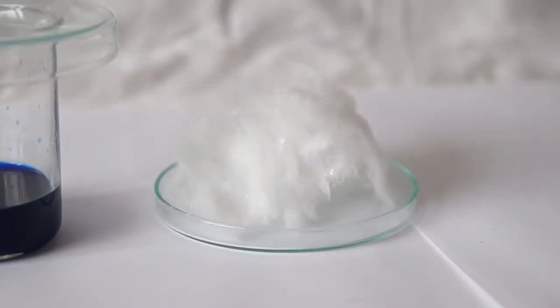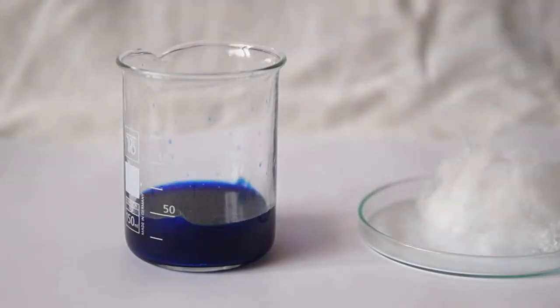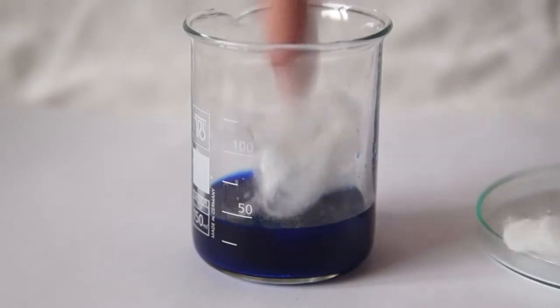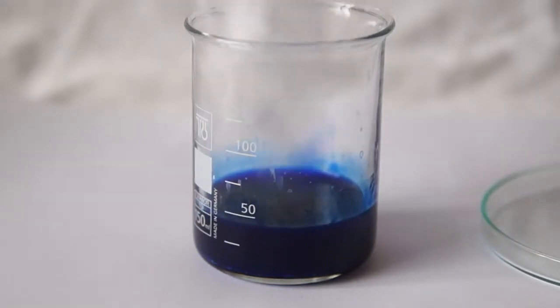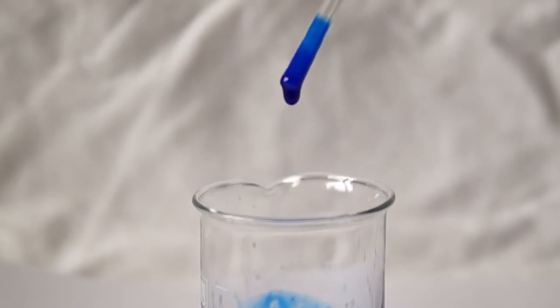This solution can dissolve cotton wool. To do this, I am taking about a gram of cotton wool and began to add it slowly to the copper complex solution. The wool is highly soluble and forms what is called viscose, which is the raw material for the production of artificial silk. After the wool has been dissolved, the liquid in the cup has become quite thick.